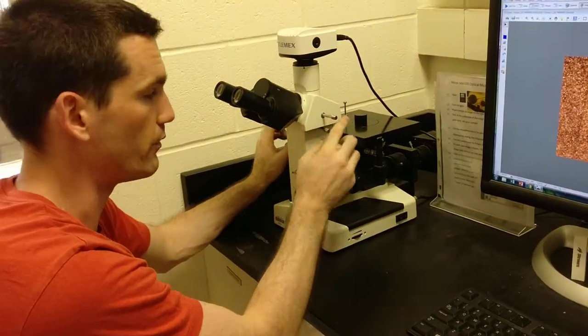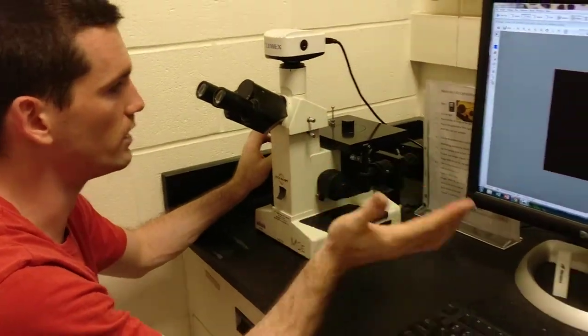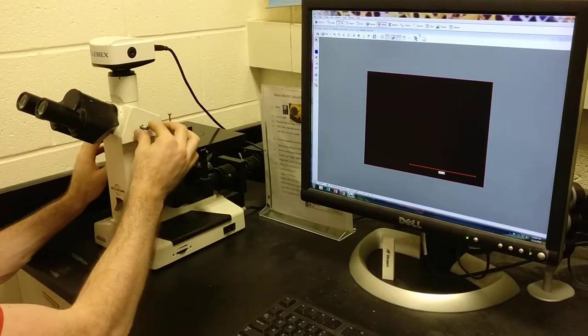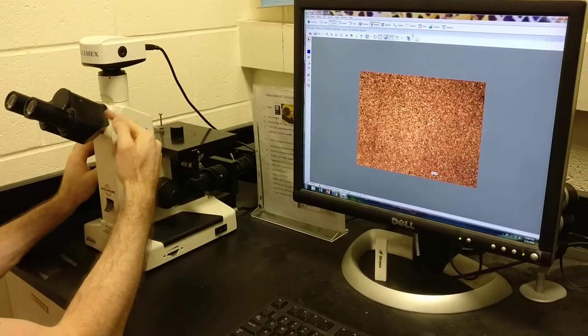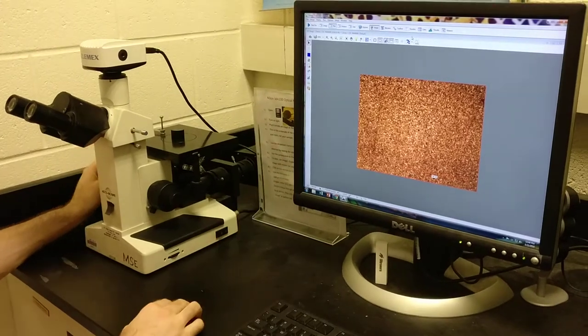We have this peg on the side which transfers it from a camera image to a binocular image. So it basically turns the light one way or the other here. So I'll make sure it's going to the computer.